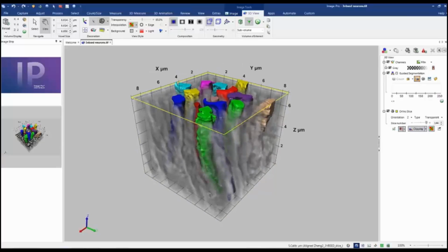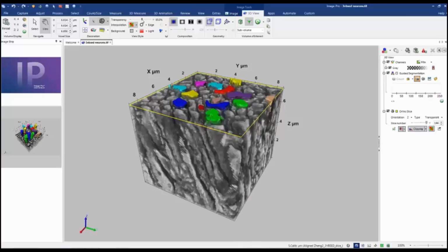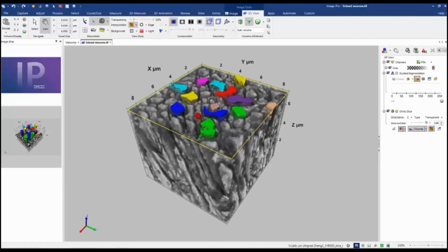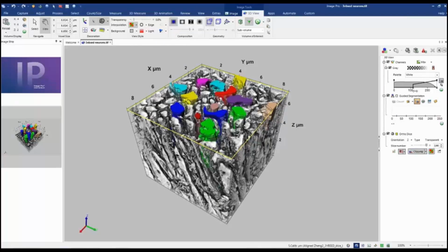Before creating animation, I want to set the parameters which I think would be the best for my image. I reduce transparency. Also, when creating animation, I would recommend increasing the number of slices in the composition to maximum so you get the highest quality image. And I would also use pseudo surface, which would enhance neurons.